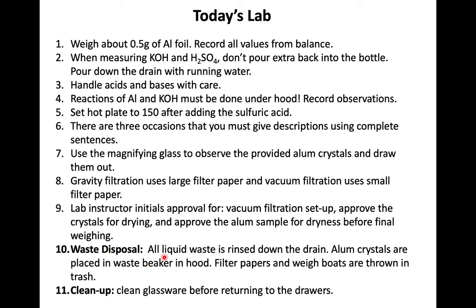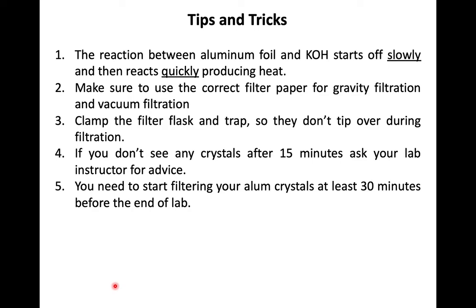For waste disposal, all liquid waste is rinsed down the drain. Alum crystals are placed in waste beaker in the hood. Filter paper and weigh boats are thrown into the trash. For cleanup, clean glassware before returning to the drawers. And finally, a few tips and tricks.